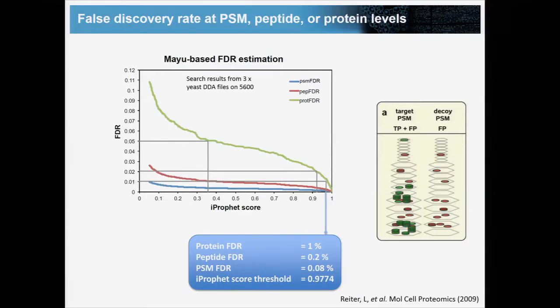It really becomes a problem at the moment when you work with many shotgun runs. So it's very important to be aware that these are not set in stone. These numbers that you see there, it will not always be like this. Just the opposite. It will depend on the number of input samples. Absolutely. So this should be evaluated case by case.